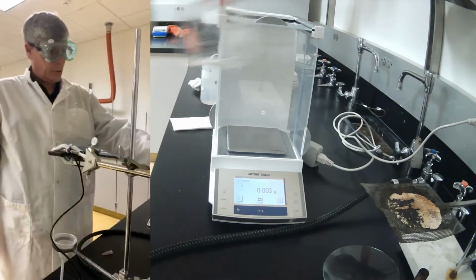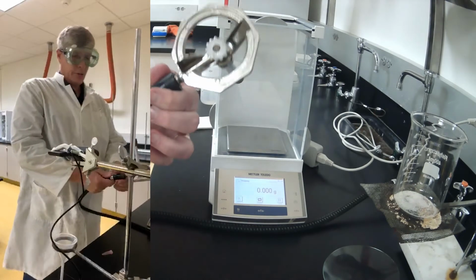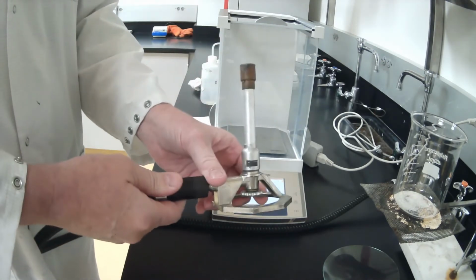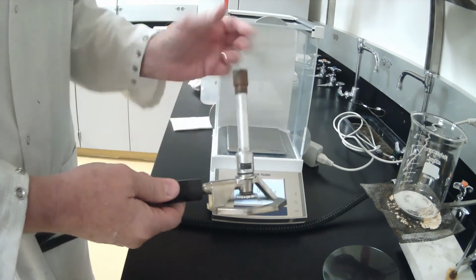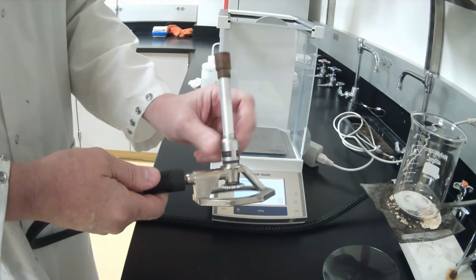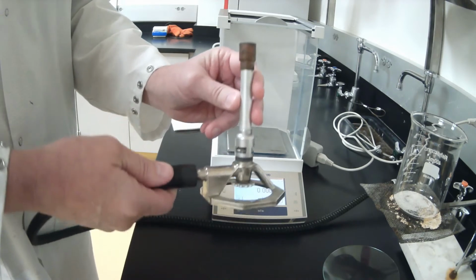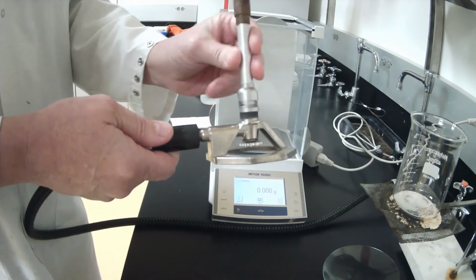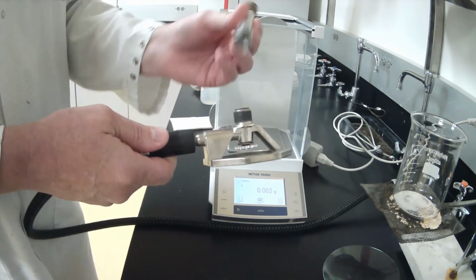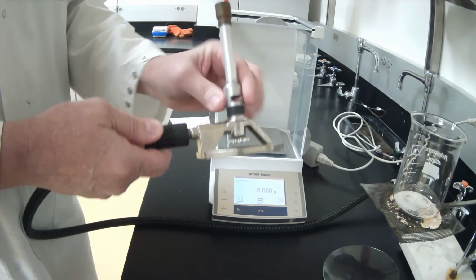Next, we're going to set up a Bunsen burner apparatus, but before we do that, we need to demonstrate the proper use and technique of a Bunsen burner. These are the Bunsen burners we prefer to use in our lab. They have 2 moving parts. The column here, as you unscrew it, lets more and more air into the mixture, as you can see here. You can unscrew it too far and the column will separate. Please do not do that when you use your Bunsen burners.